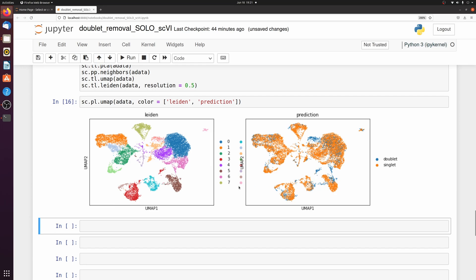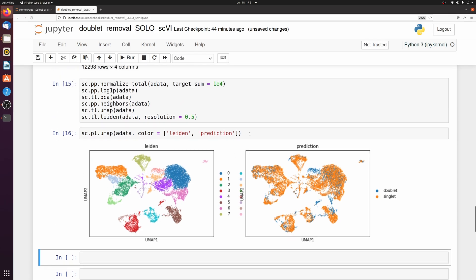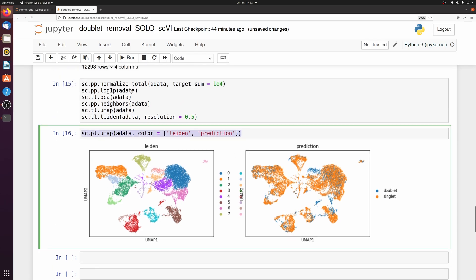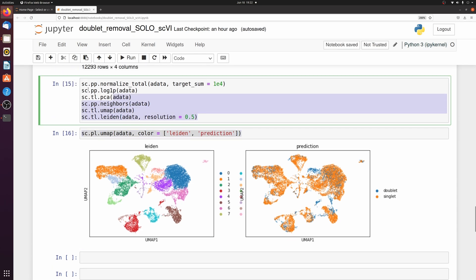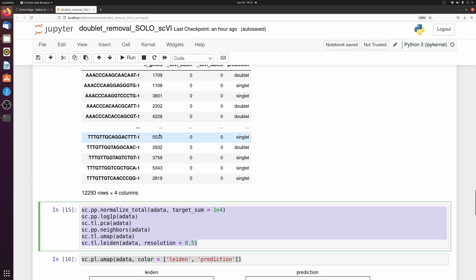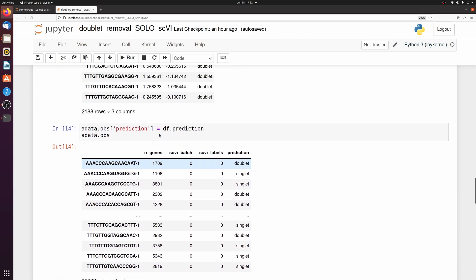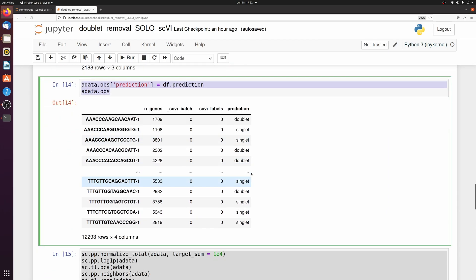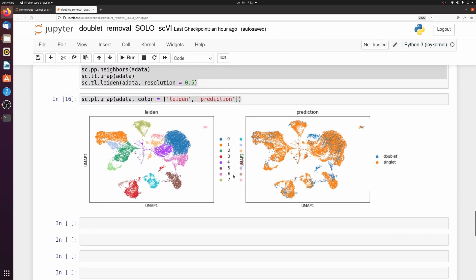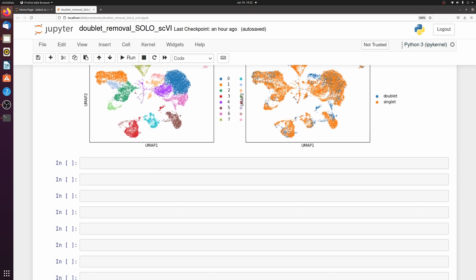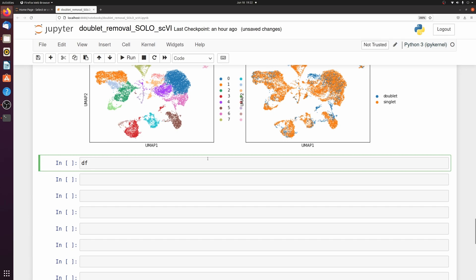So this is going to clean up the data a lot. And again, you didn't need to do this step or this step or this step, but I just wanted to show that.